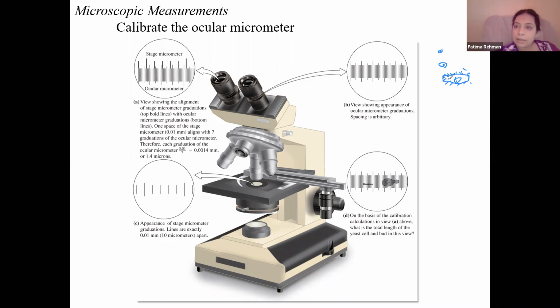And then I see maybe little mitochondria in there. Who knows? Maybe not at this one, but at 1000x definitely I'll see a few more things. So I see a lot of details now, right? Now, if I was to try to figure out the size of this cell, I can't simply do that by looking at this, because obviously the cell is still the same size.